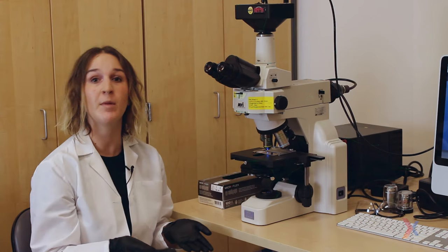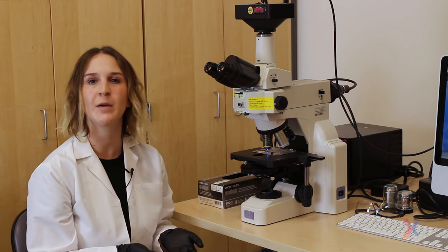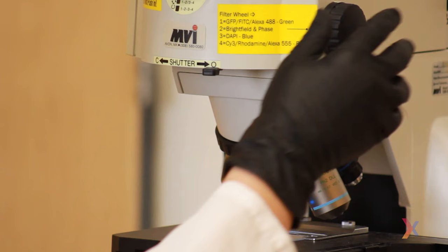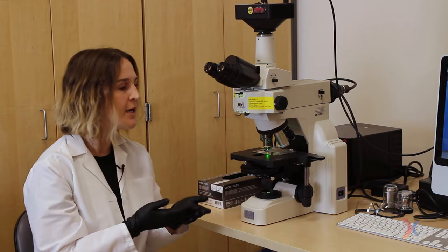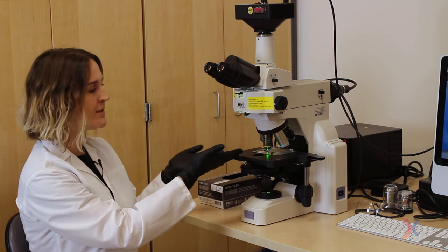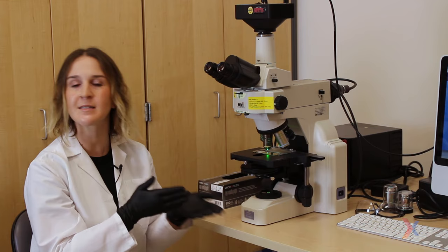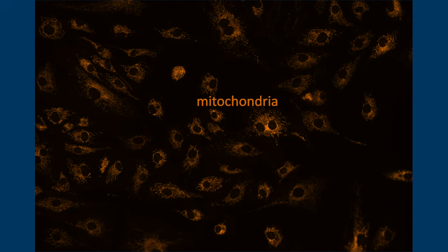Now you might have labeled some other proteins in your cells with a different fluorescent molecule. And in order to see them you would be able to use a different filter cube. So if I turn this wheel here I'm changing which filter cube I'm using, it has a different excitation and emission filter and so we can see that now we're exciting our fluorescent molecule with say a green light and we're collecting a slightly longer wavelength of light maybe an orange light and we can see a different structure maybe the mitochondria that we've labeled with a different fluorescent dye.